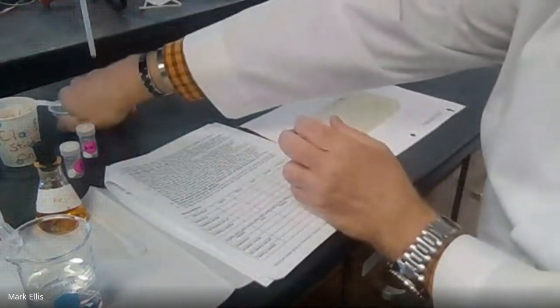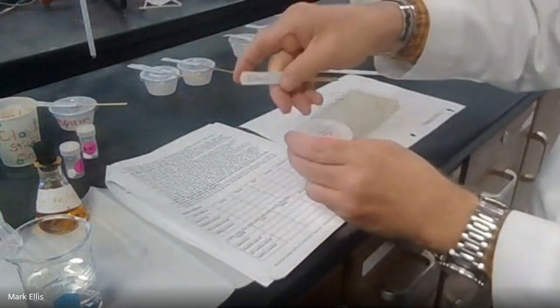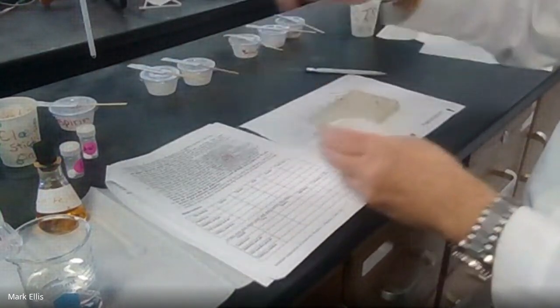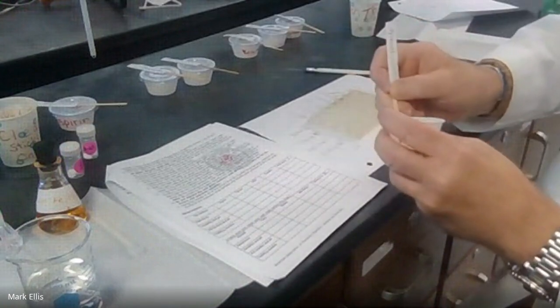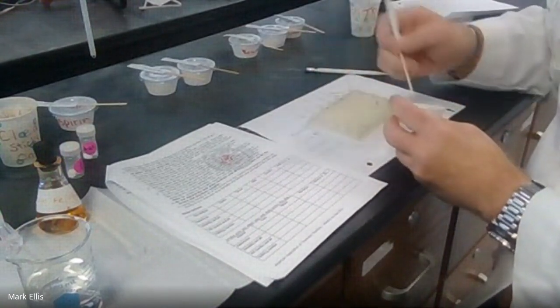Put that one aside. The next column is for Tylenol. So I'm going to take the Tylenol cup and the Tylenol spatula and just a teeny tiny little bit in each well of the second column.